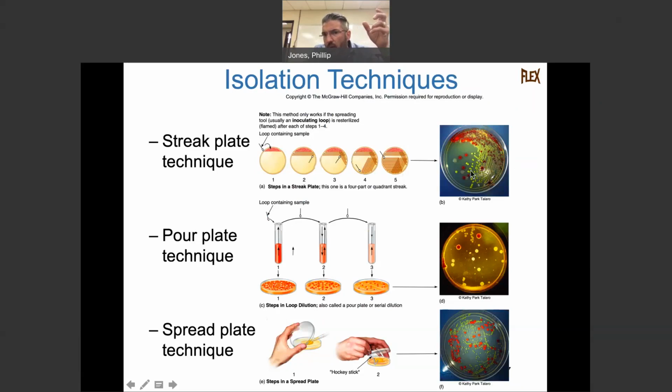And then as our final swipe, if we look, that's one different, that looks like possibly Klebsiella. It's really shiny, but Klebsiella should be more pink. All right, but we look, that should be Staph aureus because it's yellow, I can tell. We're going to see that these are all different colonial morphologies, so I know there's different organisms, and these are all pure cultures. So I could swab that, gram stain it, gram stain that, gram stain that, and I should be able to tell exactly what's here. I didn't make this plate, but I'm going to probably say there's 3 different organisms here.